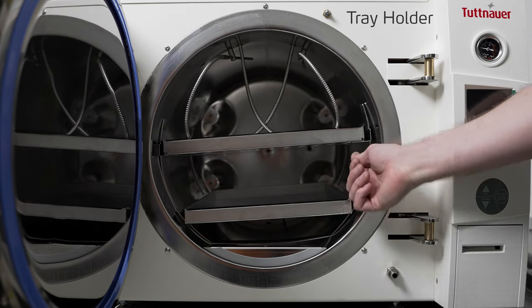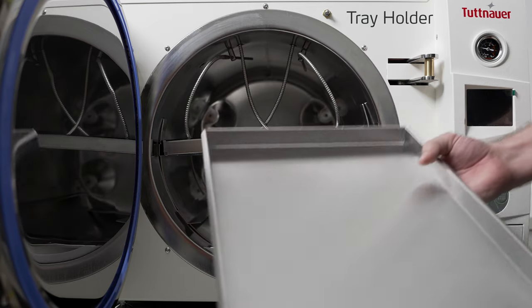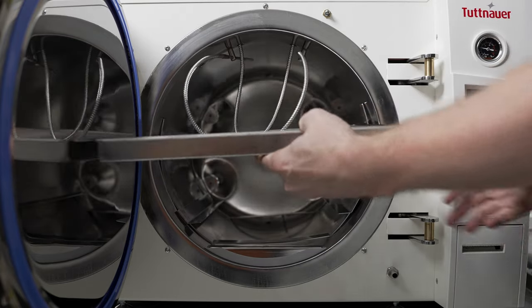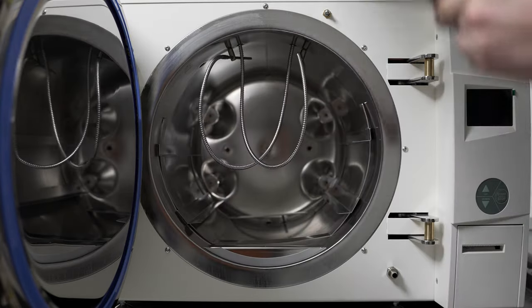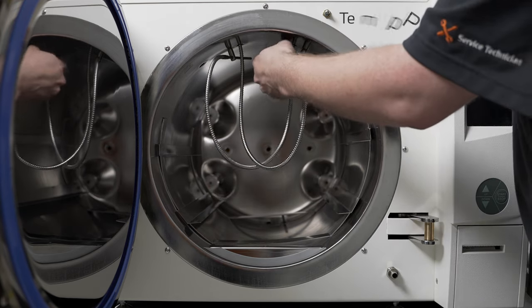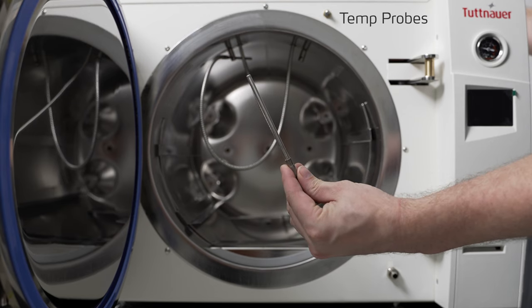Inside of the chamber we have the tray holder as well as the small solid tray and the large perforated tray. Located at the top of the chamber are both of the temperature probes so that you can monitor your sterilization media directly.